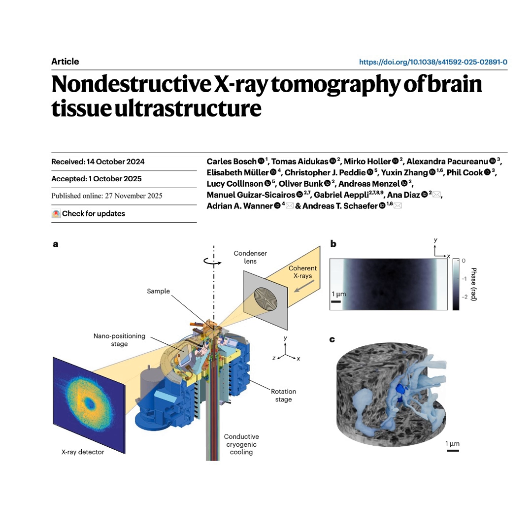That makes sense. Okay, so we've got the chemical armor with TGPAP. What was the second part of the defense? Physical stabilization. They used a system called the OMNY stage. OMNY. And this cooled the samples to cryogenic conditions, below 95 Kelvin. So why the extreme cold, even with this super tough resin? Because the cold just drastically reduces all molecular motion, even with the toughest material. That immense X-ray energy still causes movement, thermal expansion, localized changes. So freezing just locks all the atoms in place. Essentially, yeah. It minimizes any blurring that could be caused by that massive energy dose.